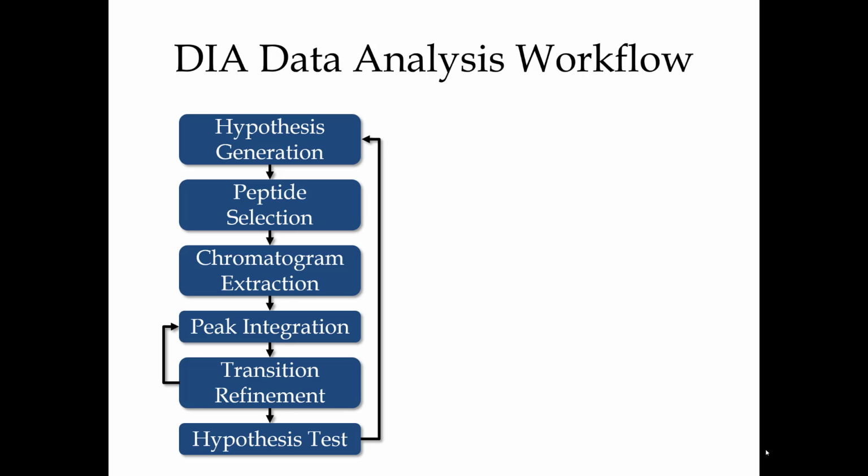So you could sort of cycle down here, then you do your hypothesis test, and now you could go back and do another hypothesis, right? You can come back to this data a fair amount, but the experimental setup is important, and also just knowing your way around the data and the tools helps you to do this cycle on the data.